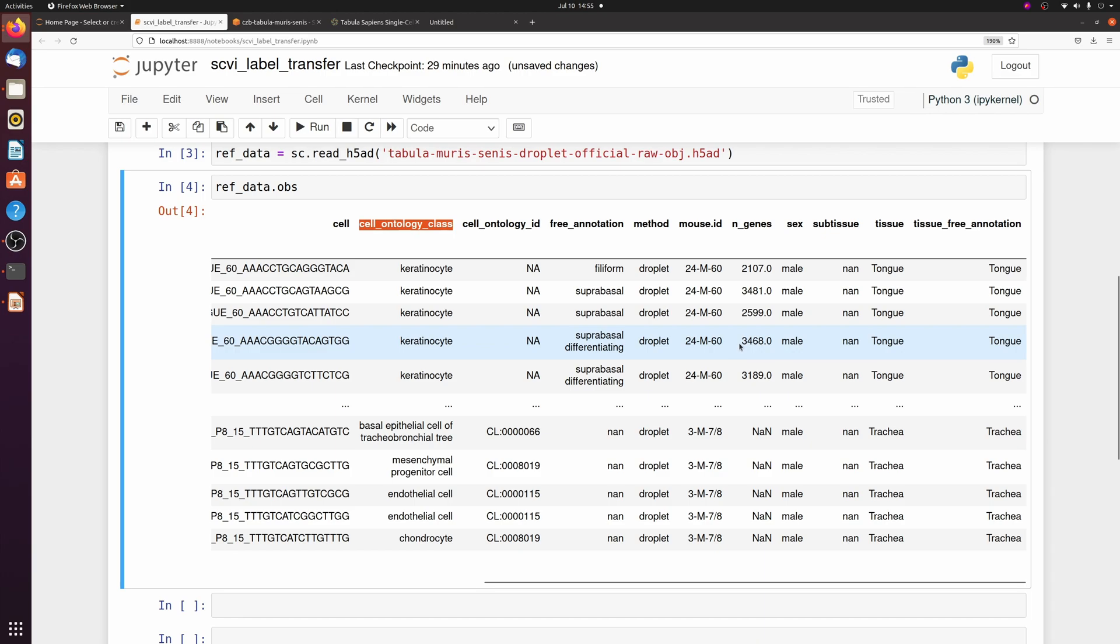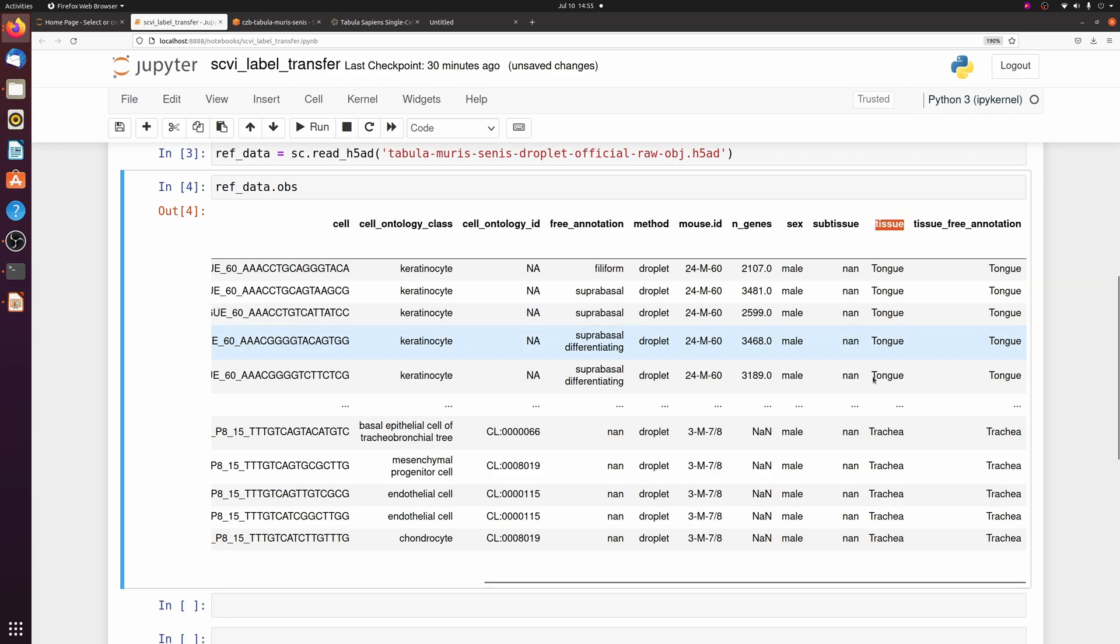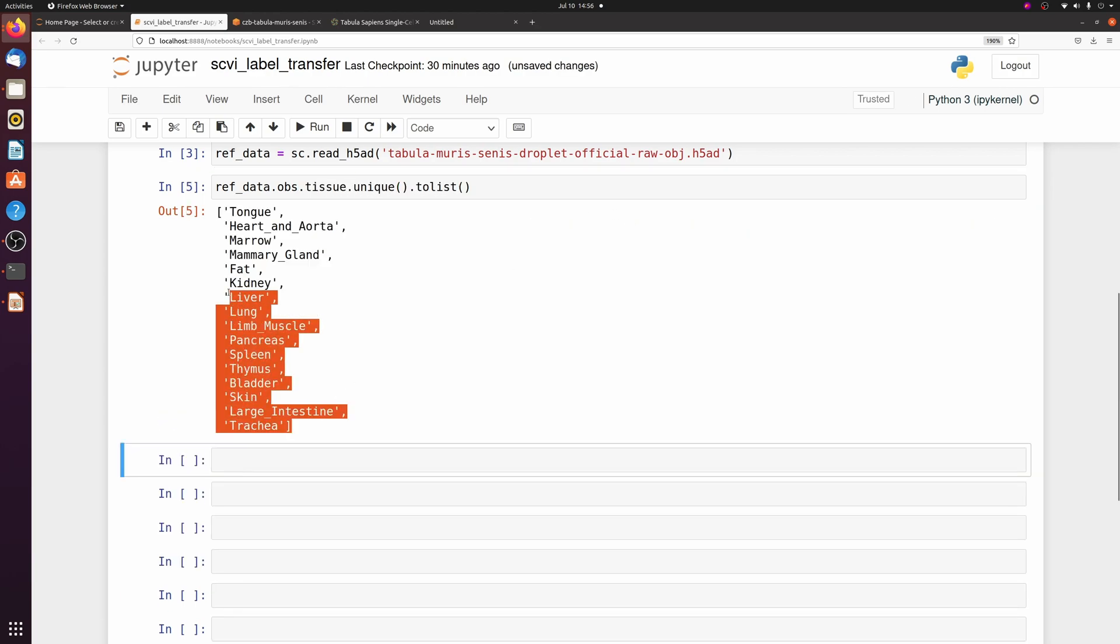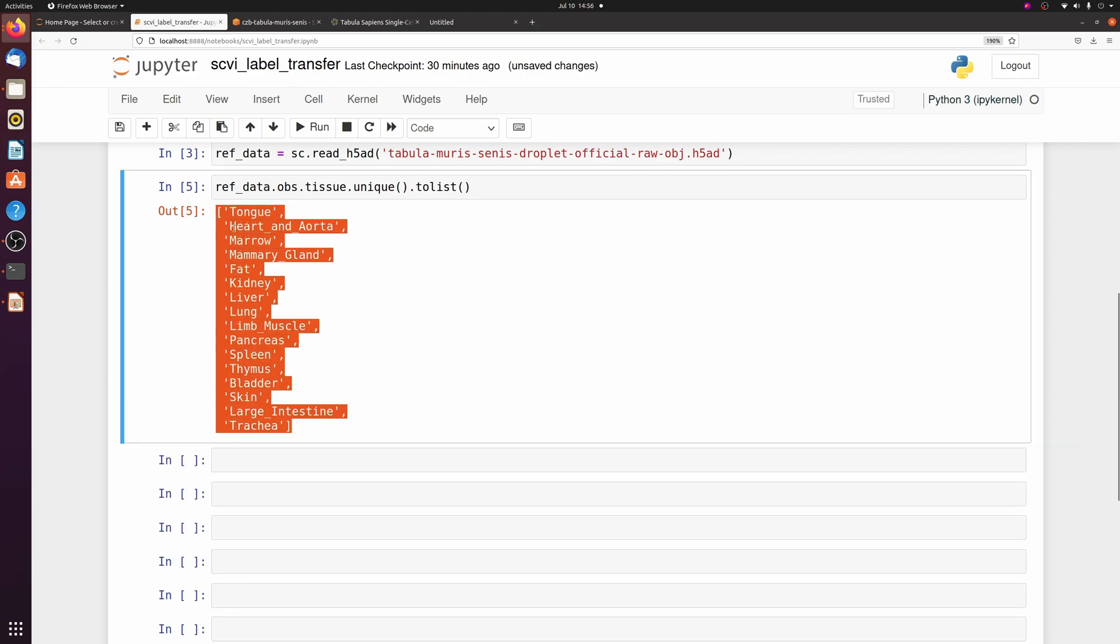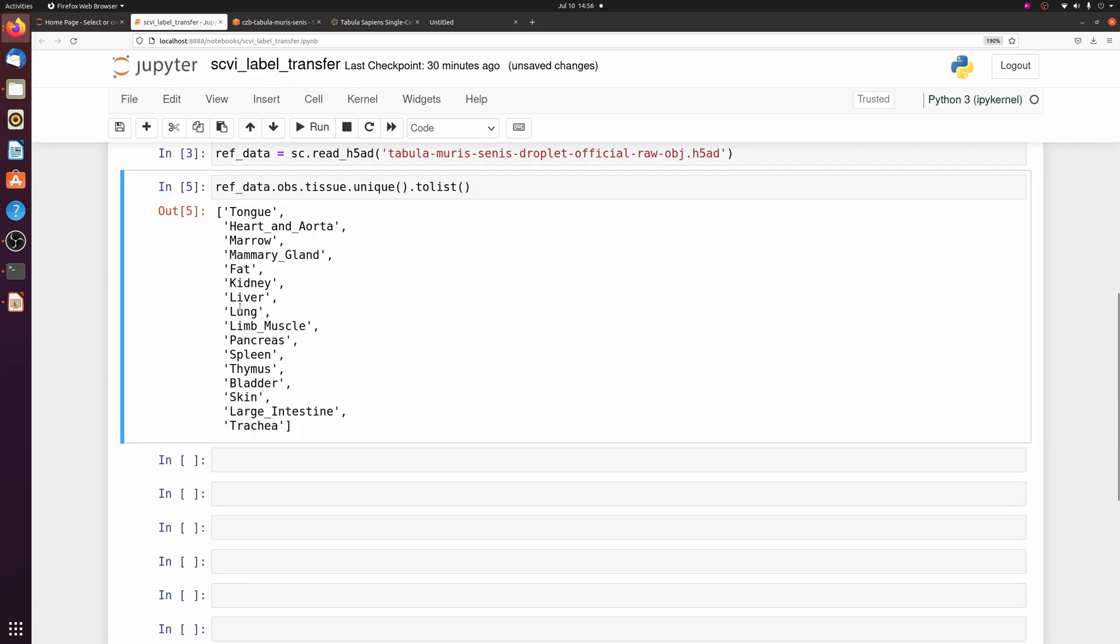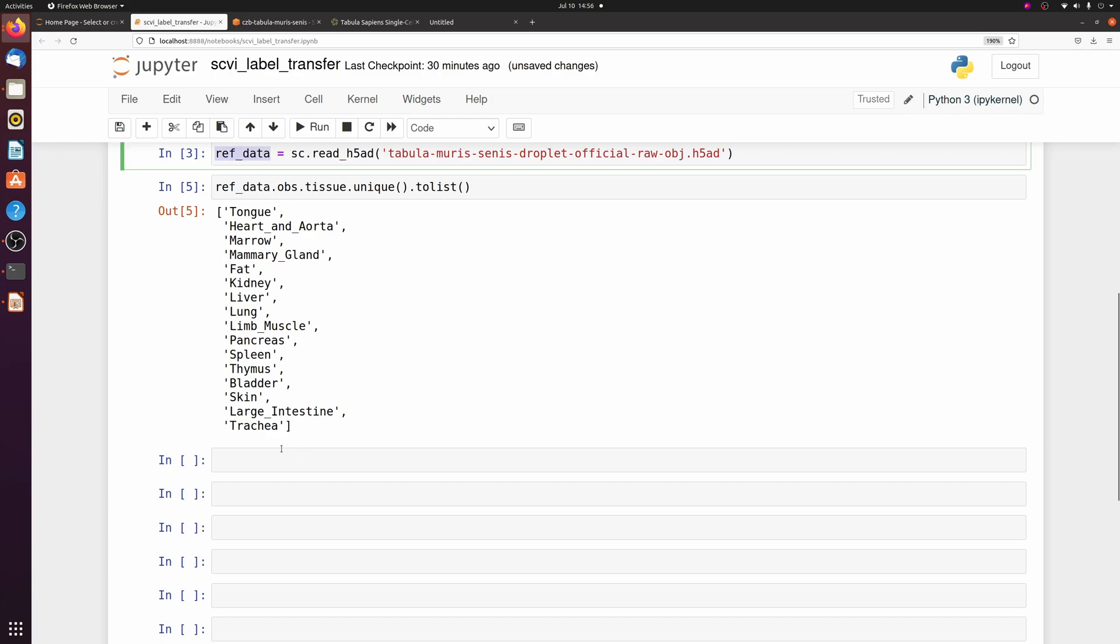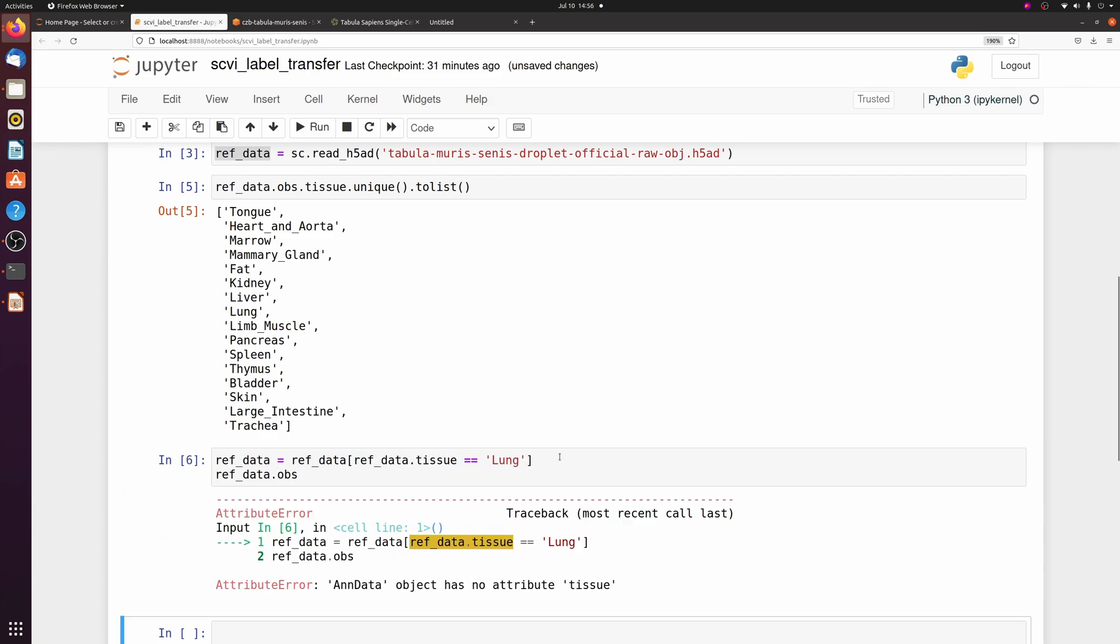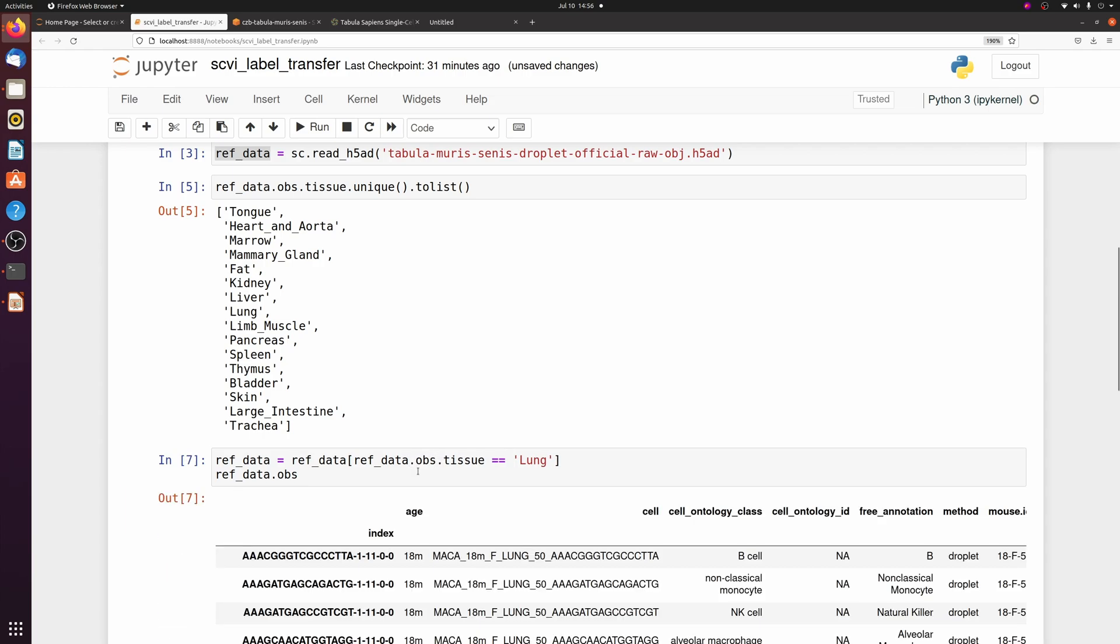So there's two labels we're really interested in: one is the tissue and the other is cell ontology class. I'm going to be labeling lung data, so I'm going to subset this and only take out the lung cells. First, let me show you all the different tissues it has. These are all the different tissues in the dataset. I only want lung, so I'm just going to subset ref data.